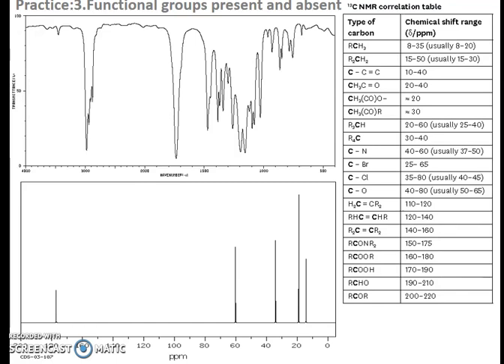We've also got a peak at about 60 ppm. And that is most likely to be a carbon oxygen peak. And this is strongly making me think this is an ester. We've also got the peak at about 1740 on the IR spectrum, which again is about the range that I would expect to see for an ester. So my first thinking would be this is an ester. I'm also noticing that the peak at about 20 ppm on the NMR spectrum is about twice as high as the ones beside it. So that could indicate that there is actually some symmetry in the molecule so that we've got two carbons with the same carbon environment.